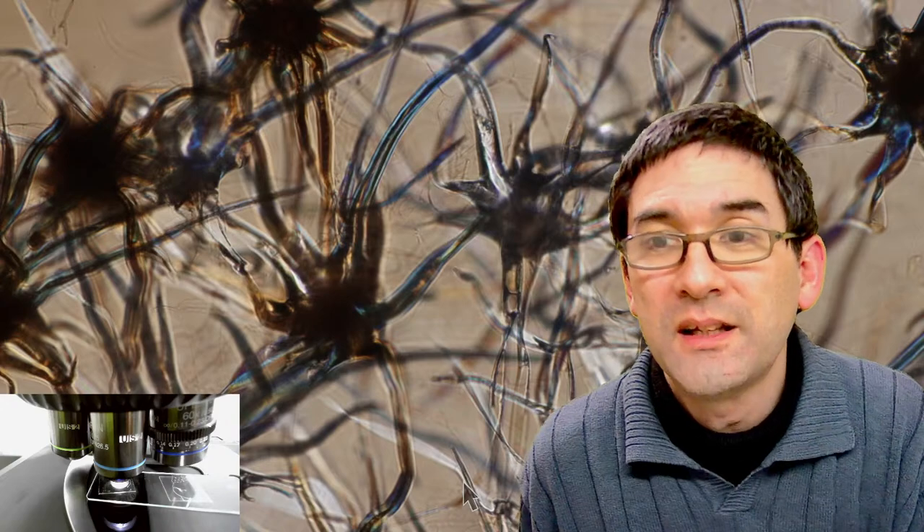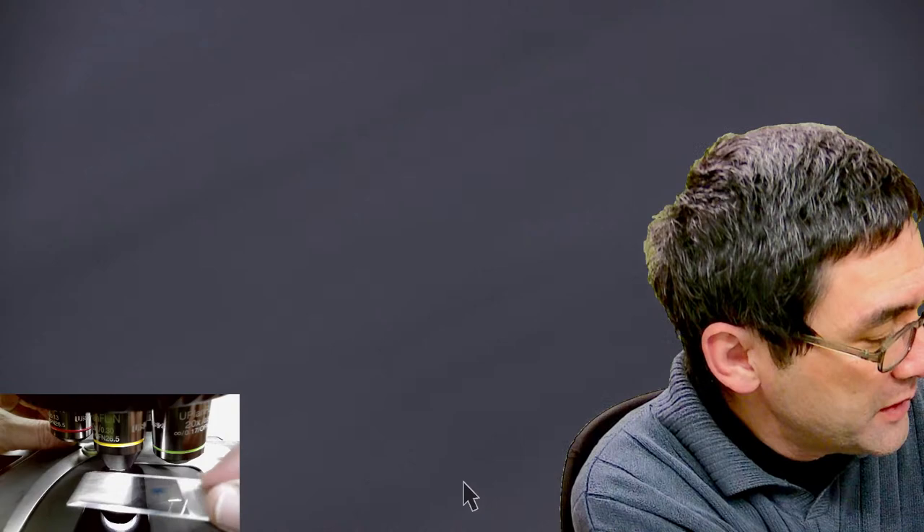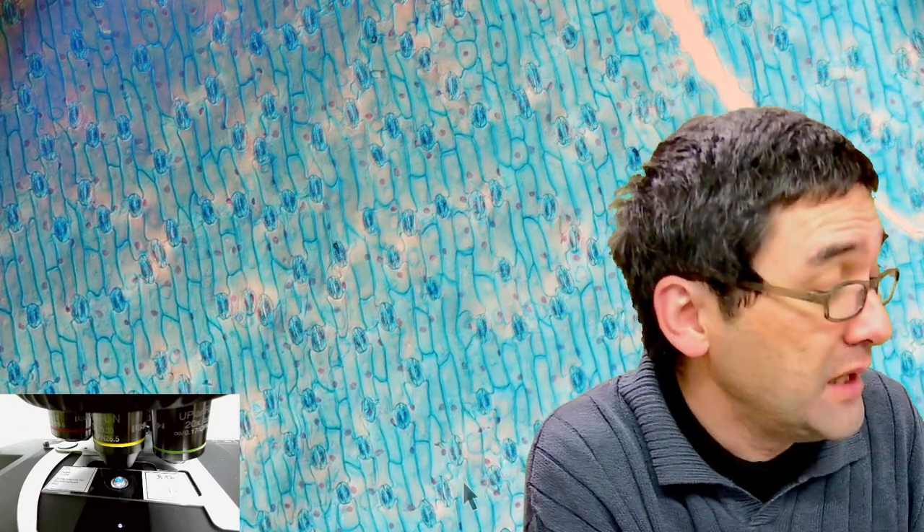What are those tulip cells stained with? That's a good question I was asking myself. I think it might have been methylene blue because it's blue, but it does not say. It says tulip with stomata but does not say how it was stained. Blue stain in many cases could be indeed methylene blue because it's a very general purpose stain.